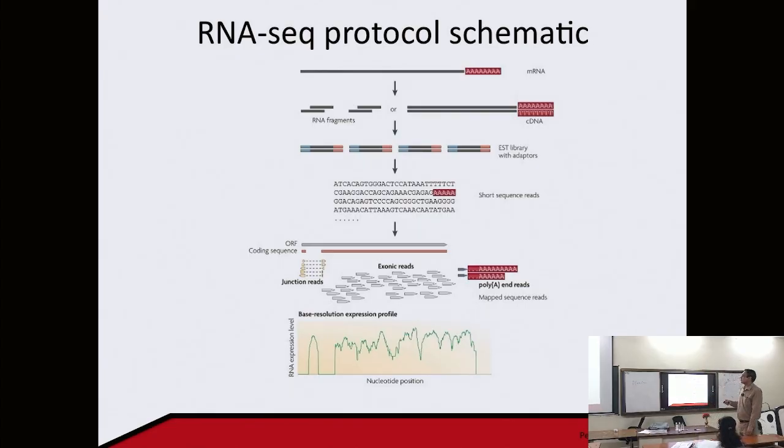So here RNA is fragmented. There could be many fragments of RNA, typically of the same size, and then they are ligated with adapters. Because these adapters are identifiers, you can do multiplexing. For example, you can have samples coming from different individuals, and if you have ligated with adapters, you know which read is coming from which. And this is cost efficient. You can do sequencing of many different samples at the same time this way, by ligating with the adapter.